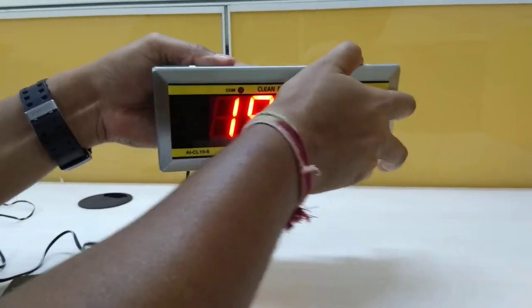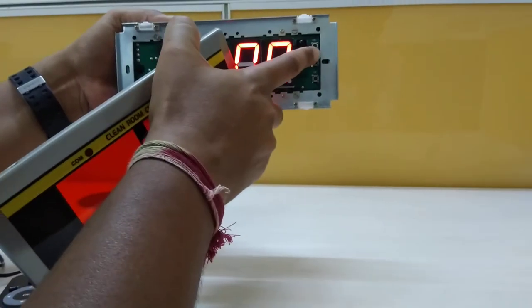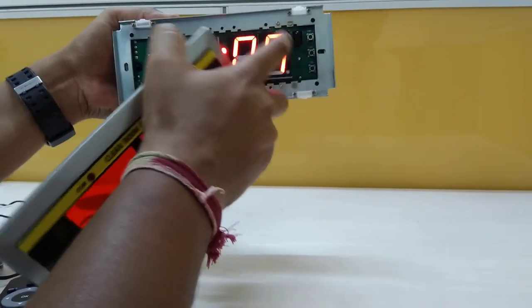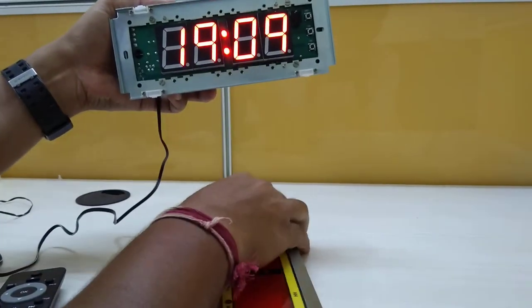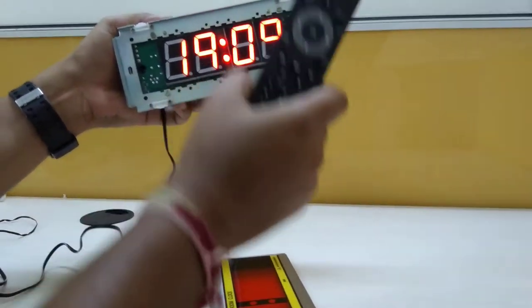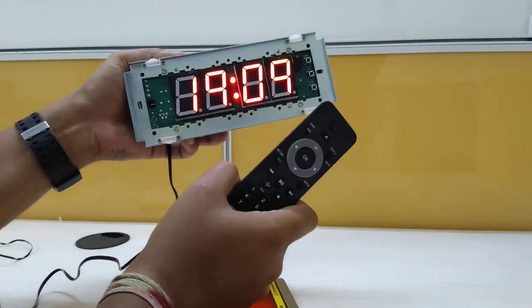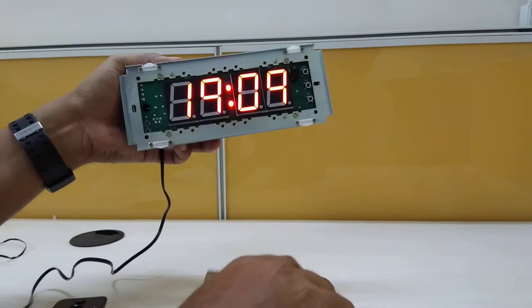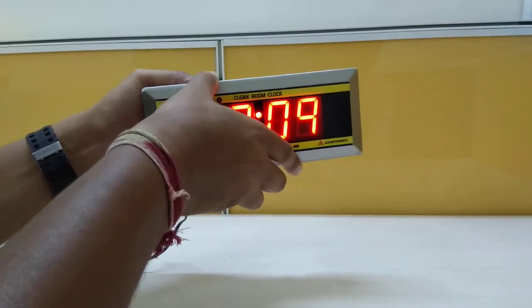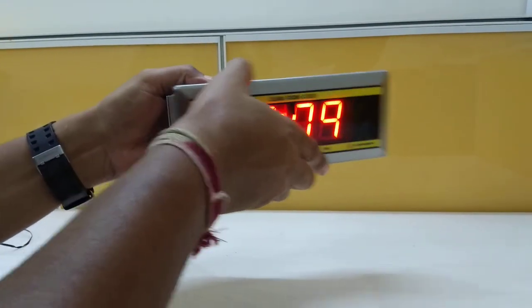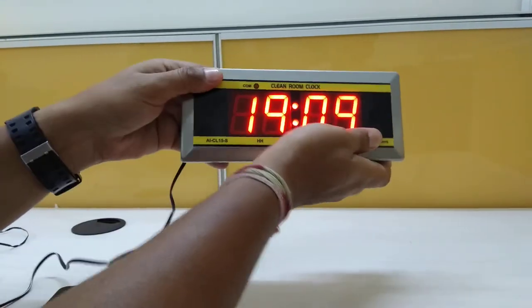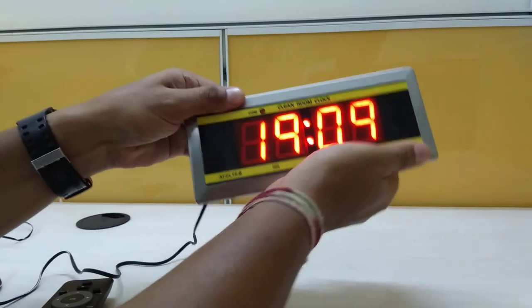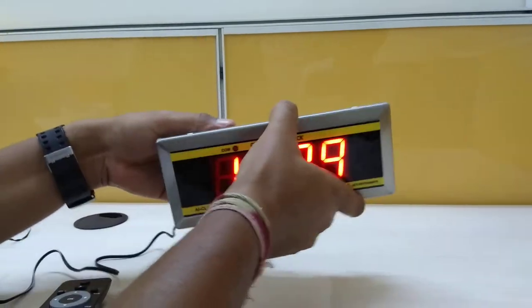Inside, we've got three small buttons for changing the time if you require. However, a remote is provided for this clock to set the time. We will close this now. This closing makes a small noise which ensures that it is now locked.